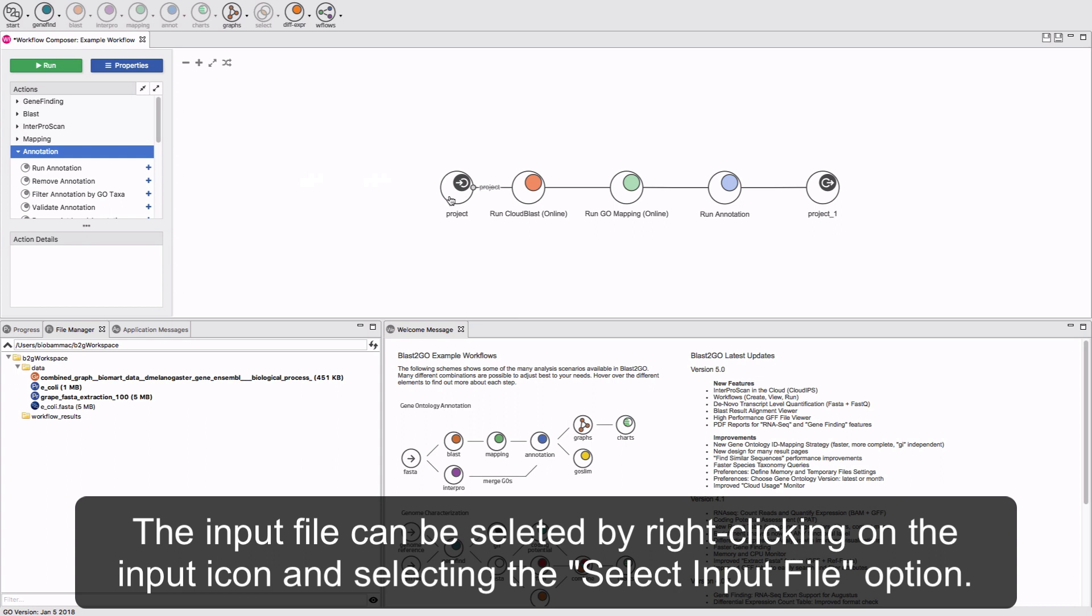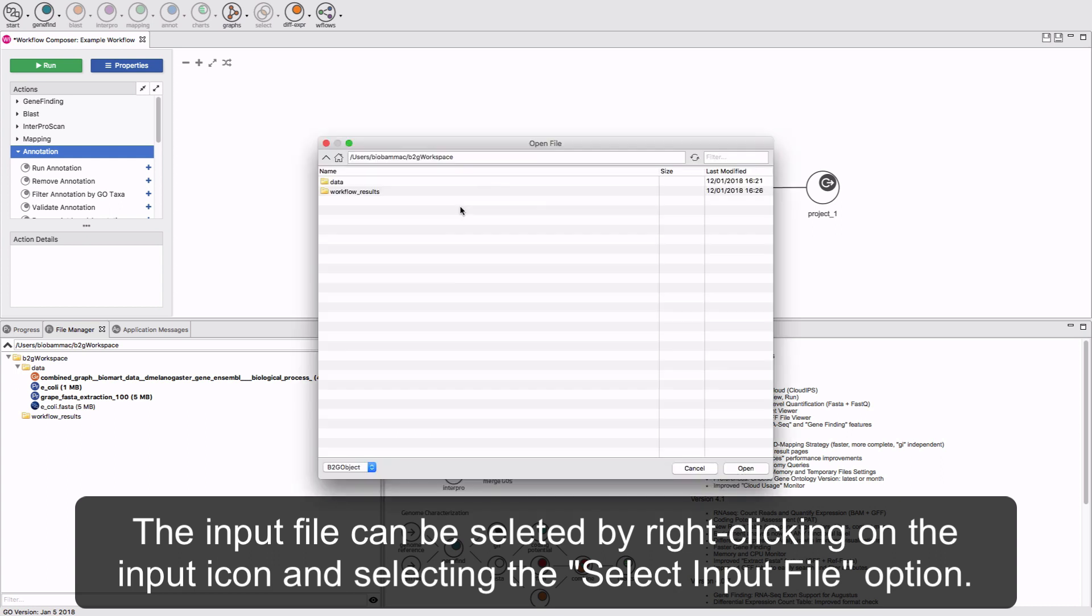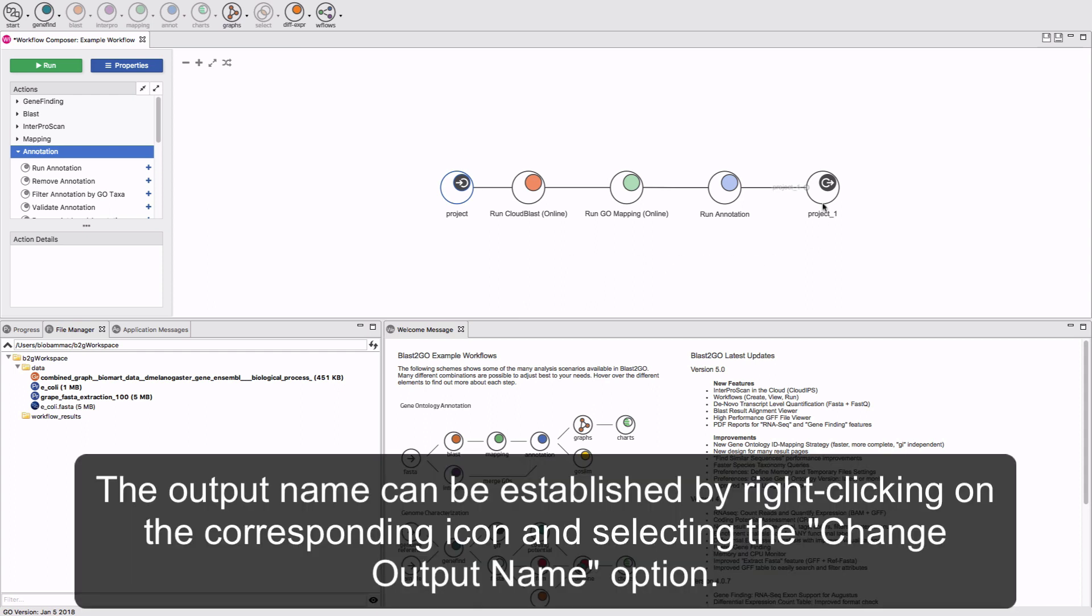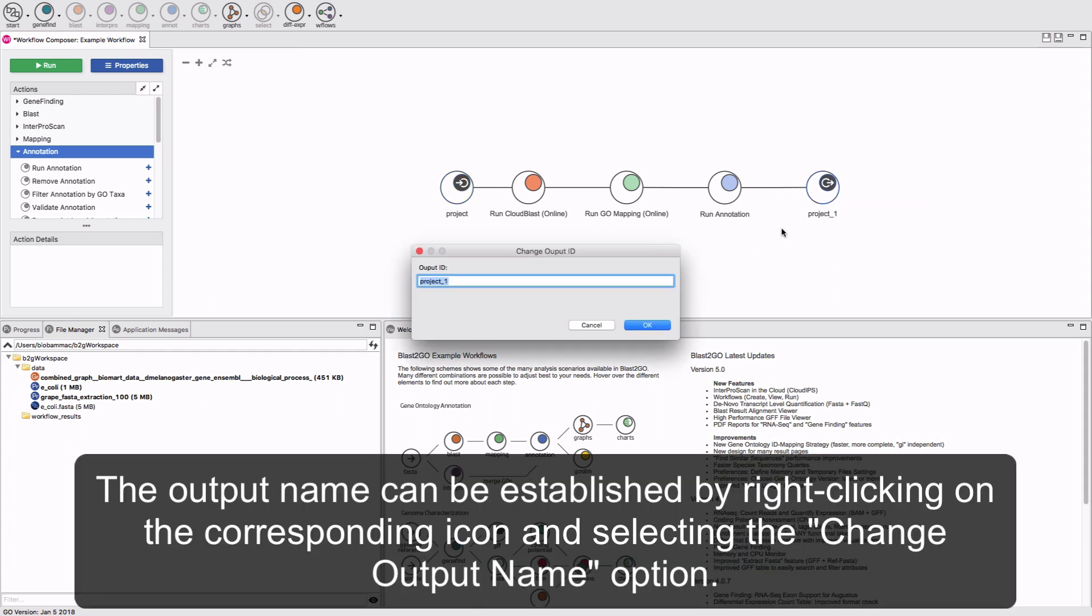The input file can be selected by right-clicking on the input icon and selecting the Select Input File option. The output name can be established by right-clicking on the corresponding icon and selecting the Change Output Name option.